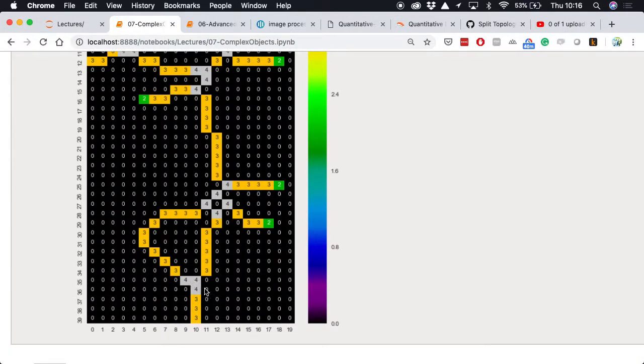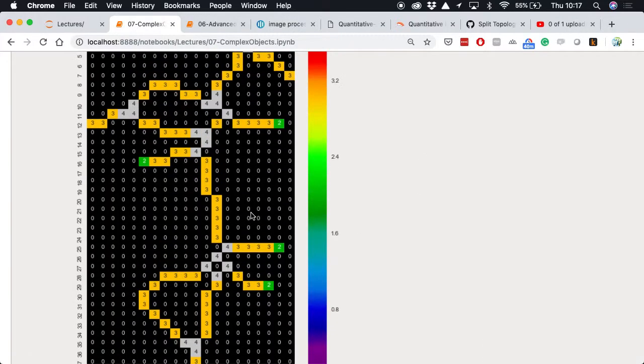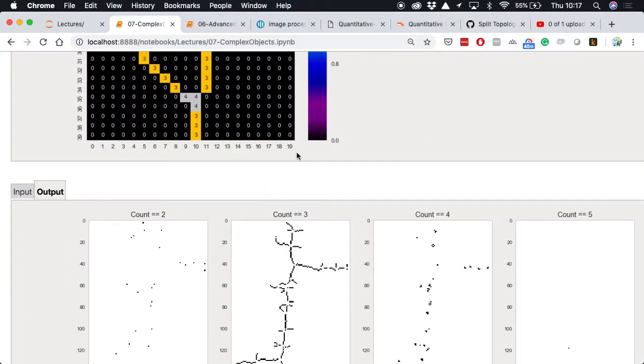We end up having multiple junction points here. So we have 3 junction points that come in here. We have 3 different fibers that are coming together, but fundamentally we have everything we need to have in the image.